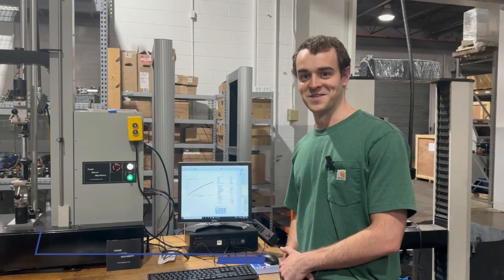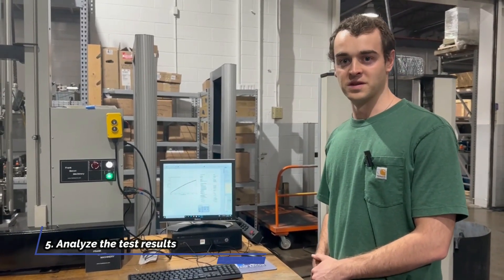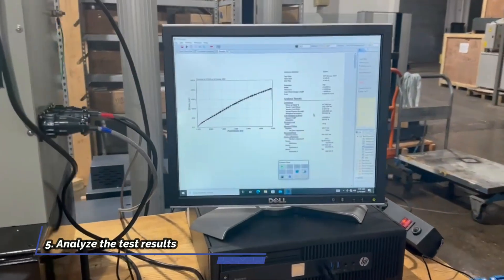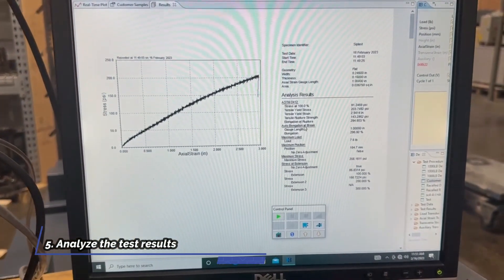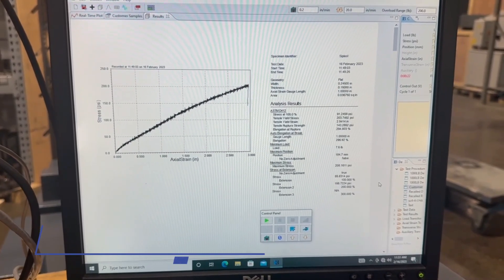Step five is when the test is done, analyze the results. As I mentioned, all the needed results within D412 are preloaded in the software. These are the specific results that ASTM D412 calls out, and everything else is just some other analyses that the customer wanted in addition to that.